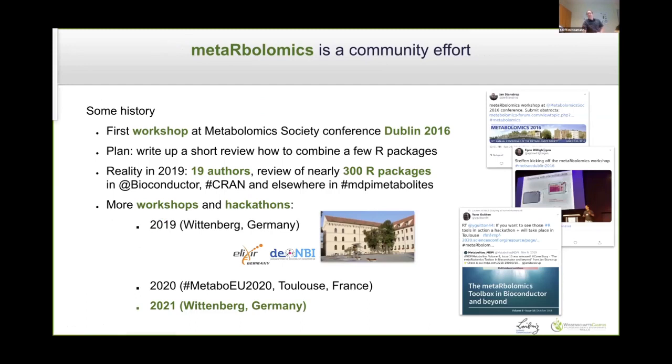So this talk that I'm giving here is really a community effort that started off 4 years ago at the Metabolomics Society conference in Dublin, where we had a workshop showcasing some things you can do in R and Bioconductor. Afterwards, we had the idea, well, just write up a short review to show how to combine a few of the packages. Now, what happened some years later is that nearly 20 authors were providing a review of nearly 300 R packages, not only on Bioconductor, but also elsewhere, and published that as a review in the MDPI Metabolites.